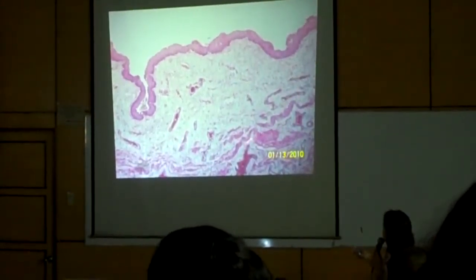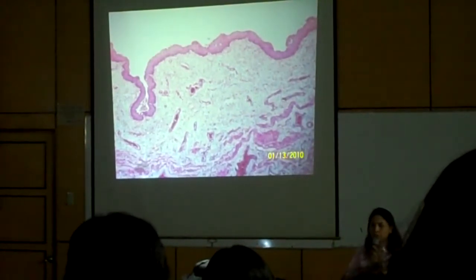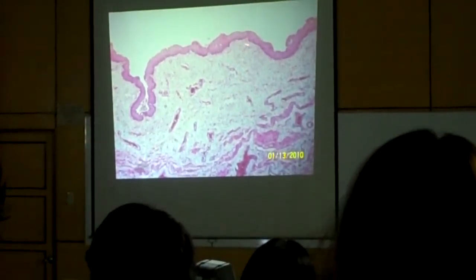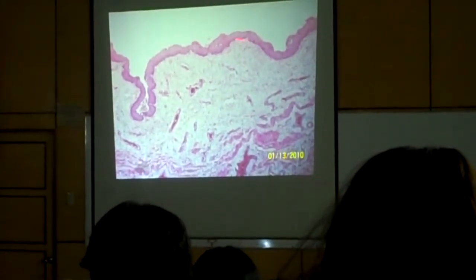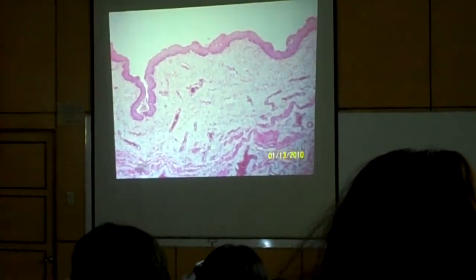Vascularized, and you have a fibromuscular tissue underneath the lamina propria. So another clue maybe, but not an absolute criteria, you may have this. You may have foldings, okay, mucosal foldings.